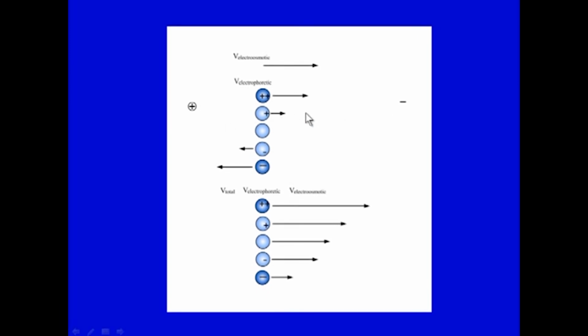So, it is a relative movement or migration depending on the charge being carried by the species. Likewise, neutral species will just move through, but not as rapidly as the positively charged species. Then negatively charged species will experience electroosmotic flow, but will move towards the other side, that is towards the anode, depending on how much charge it carries.